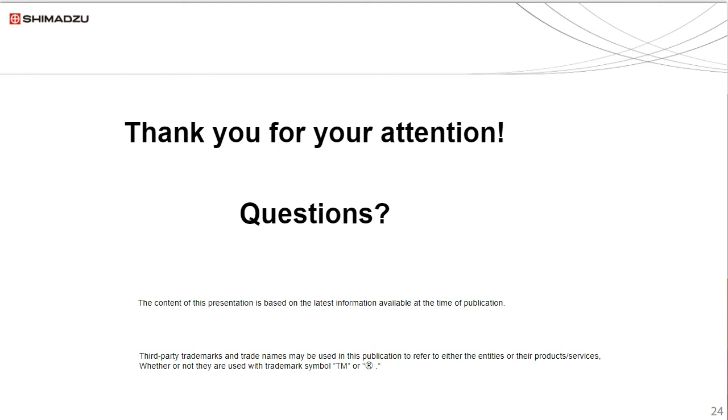And the next question is about contamination. How to avoid the contamination to arsenic, cadmium, lead, and mercury? Yeah, great question. We went into some detail about how to avoid contamination in general in the webinar, and finding where the contamination is coming from by doing method blanks. But the best way to keep that from happening is to not use any glass. Use clean reagents, clean water, clean tools, and then check your method blanks on a regular basis.